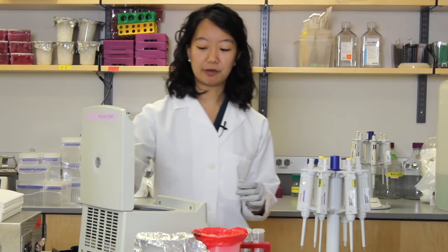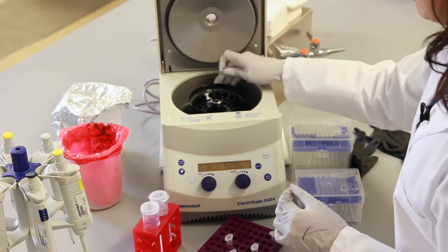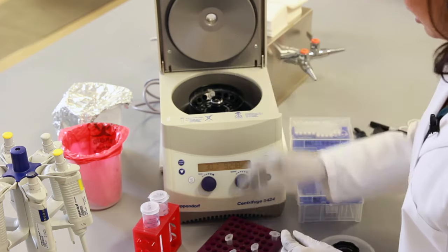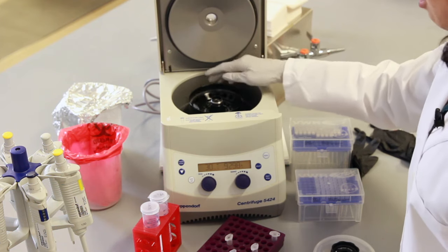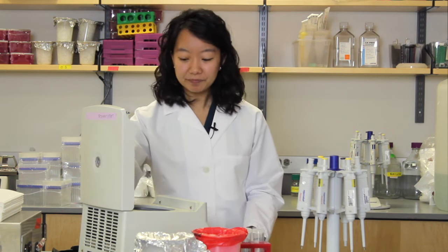When you're loading your centrifuge up, the important thing to pay attention to is that you load your samples in a balanced way around the circle. This means making sure that the weight is evenly distributed throughout your centrifuge. As I've loaded this right now with just one single tube, it isn't distributed. All my weight is concentrated on one end of the centrifuge. For a little tabletop centrifuge like this, it may not be as important, but as you do more centrifugation at higher speeds, the tiny differences in volume will make more and more of a difference.